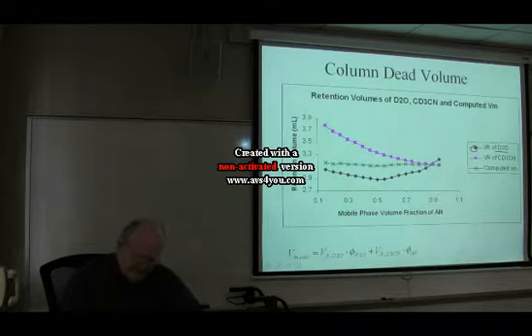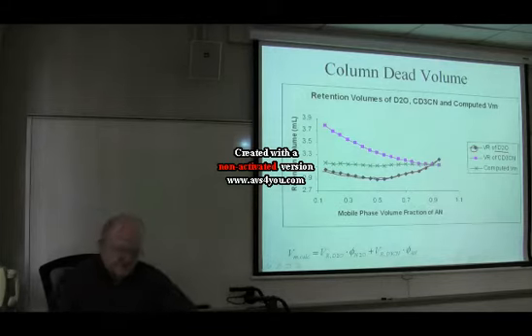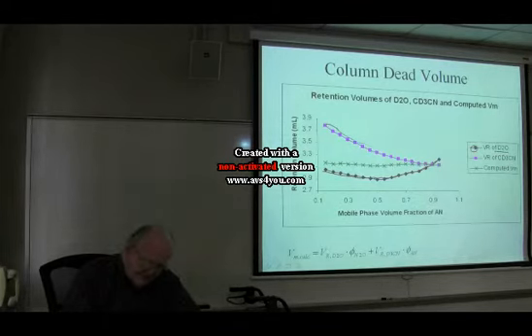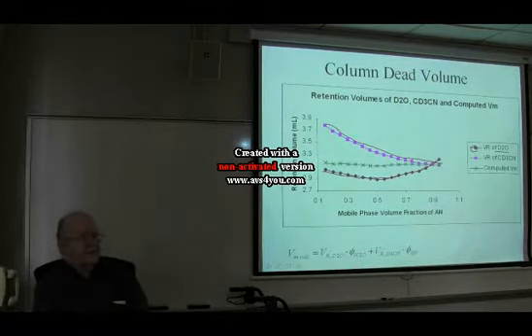If you change the mobile phase from low acetonitrile to high acetonitrile, you will see some variation in the water peak. If you inject deuterated acetonitrile, you will see some variation in the acetonitrile peak, and it will not have the same retention volume as the water peak, even though these things are your solvent.